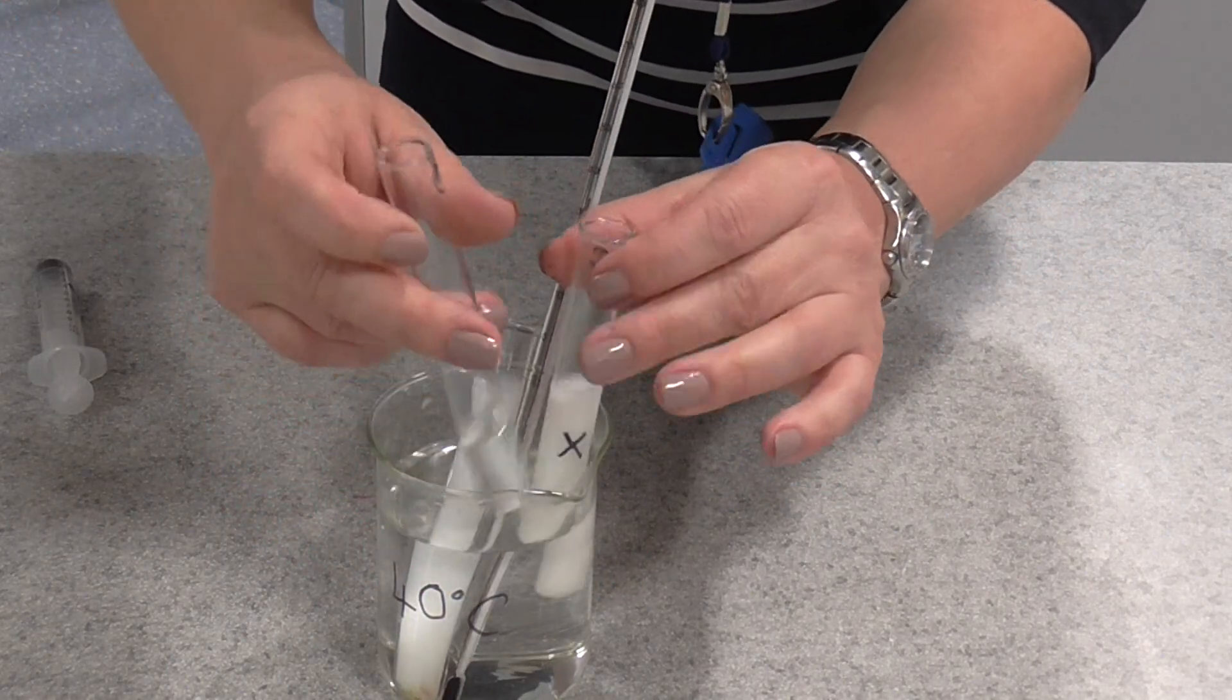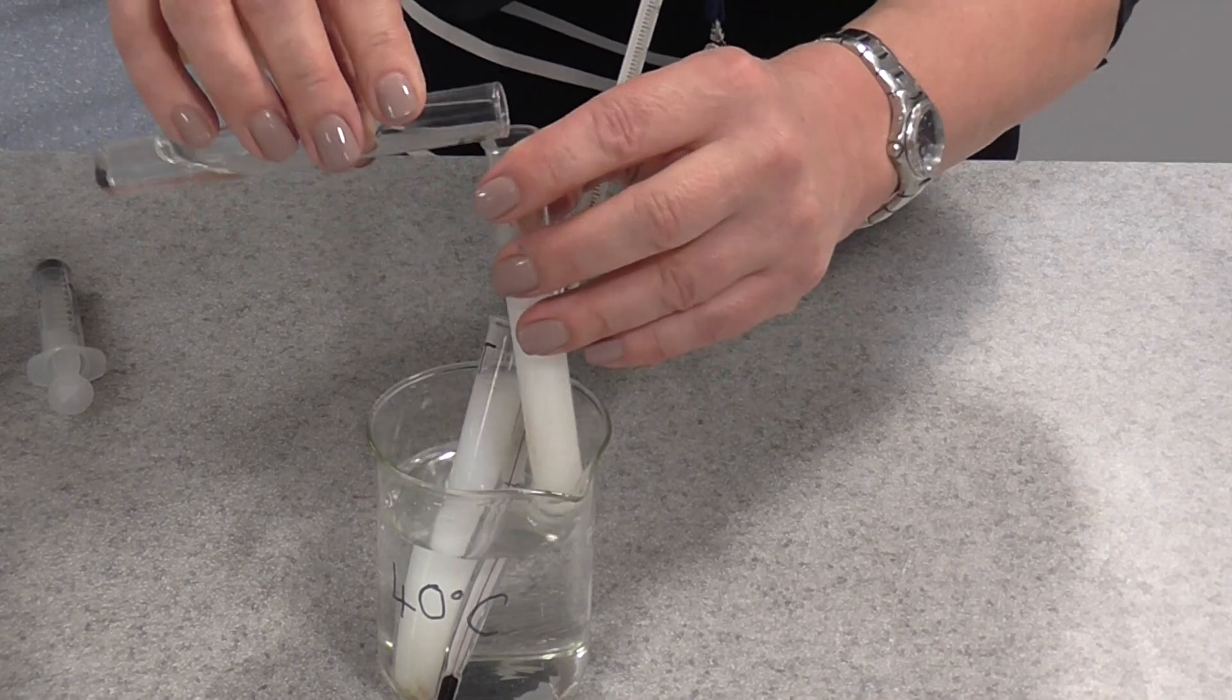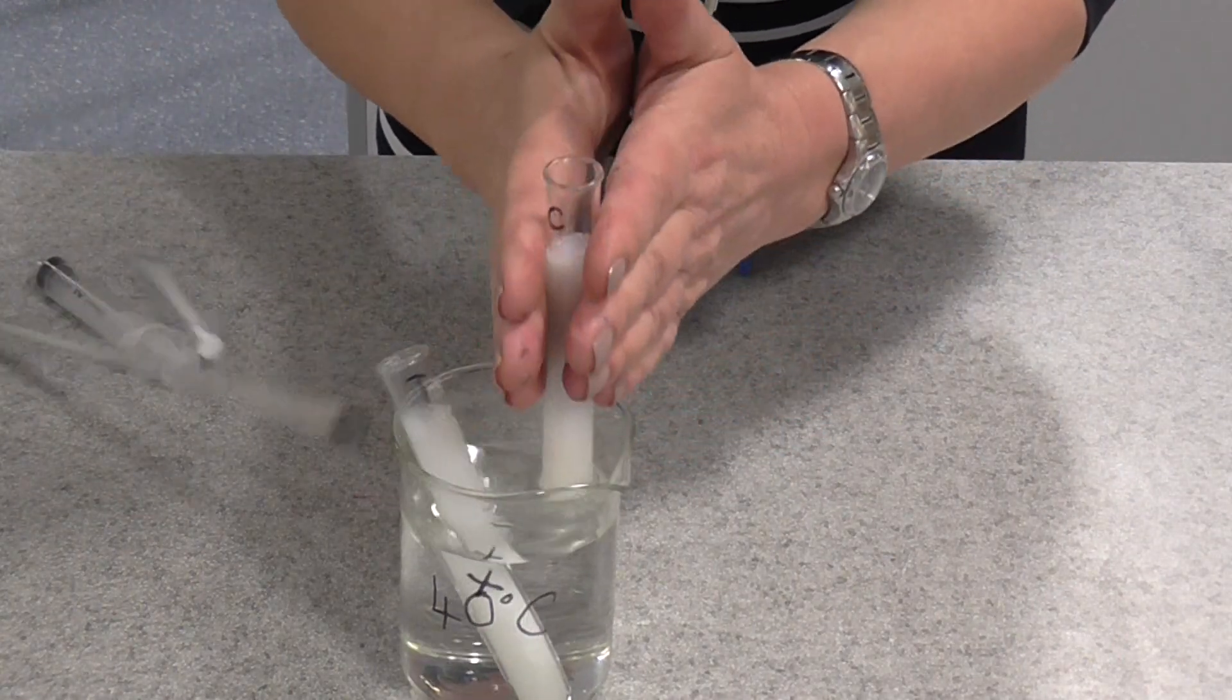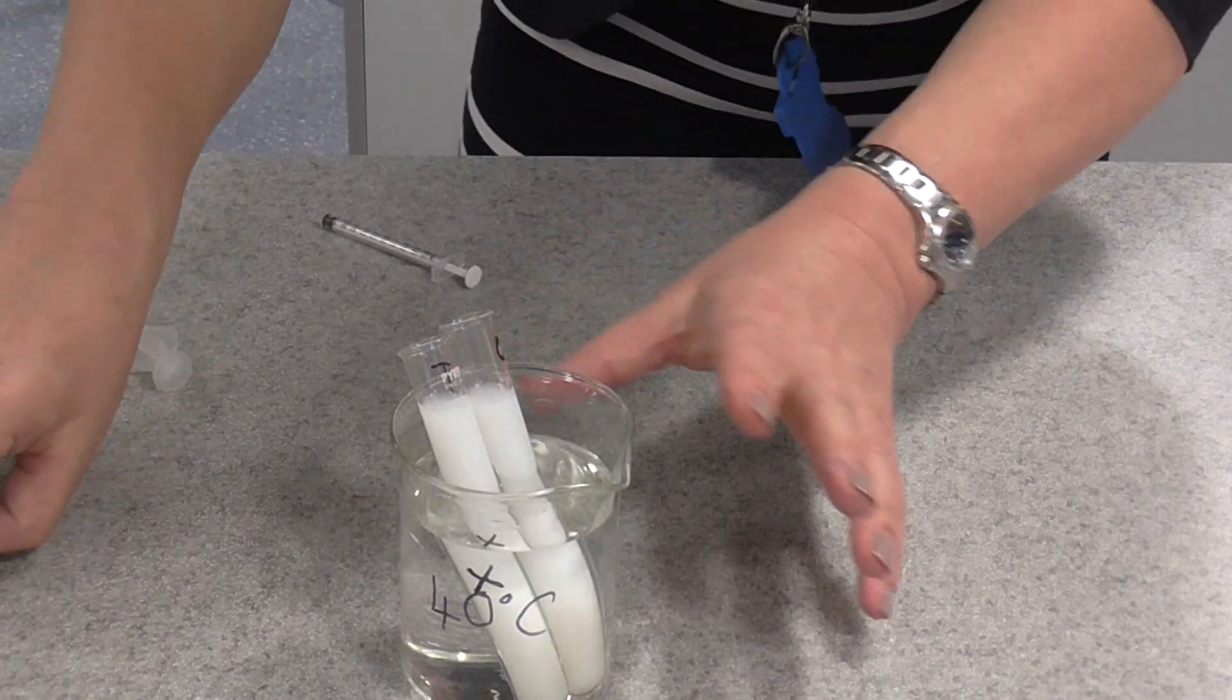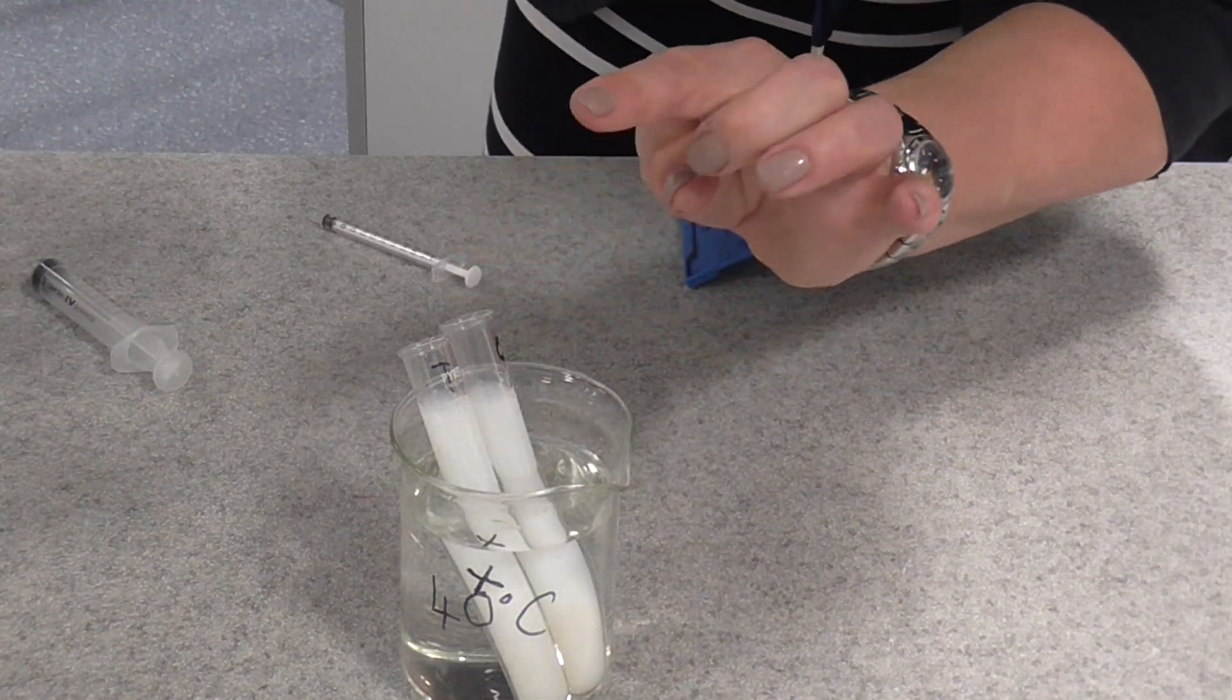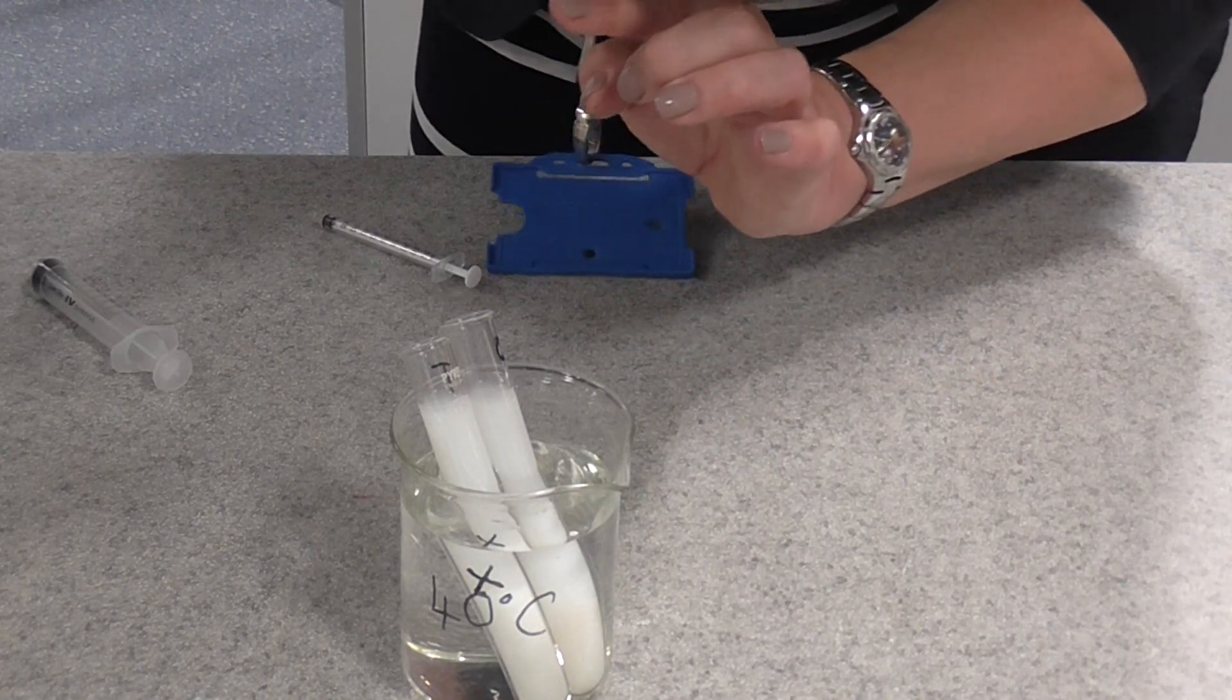Then we're going to do exactly the same with our control tube, which, remember, is exactly the same but without the trypsin enzymes. We're going to mix them, just roll it between your fingers to give it a little mix, and then you're going to leave them in the water bath. You need to start your timer immediately, as soon as you have mixed the enzyme and the contents. Start the timer.